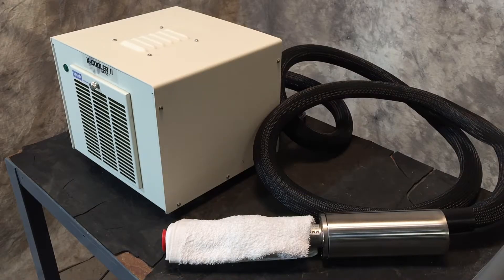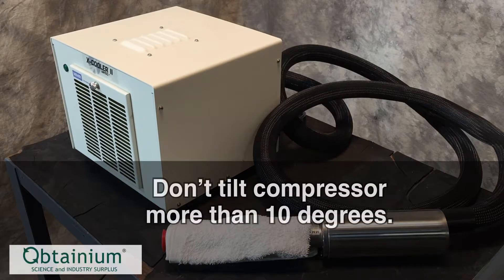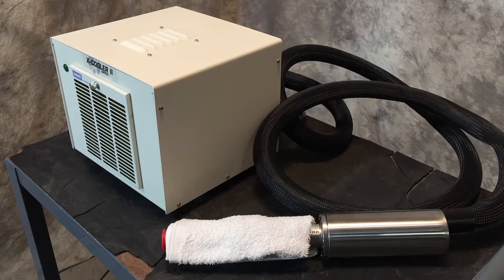We carefully transfer the unit to the cart, making sure not to tilt the compressor box more than 10 degrees. The reason for this is that there's a potential for oil to spill into the gas return lines. If that were the case, you'd want to let it sit at least 6 hours, and ideally 24 hours, before starting it up. As a routine precaution, we let these sit overnight before turning them on.